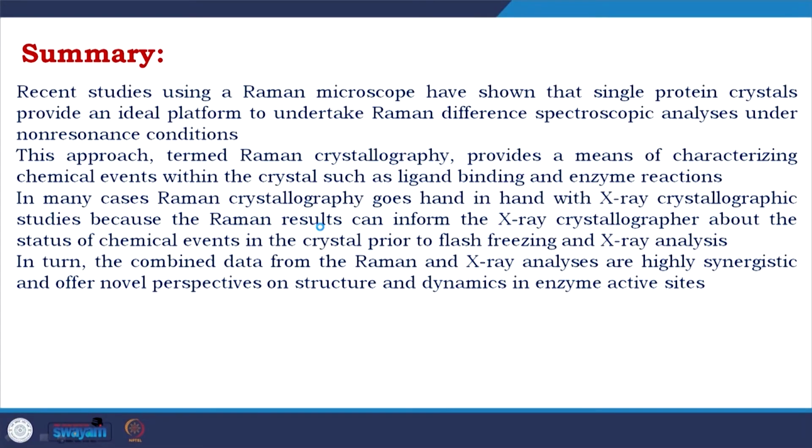But now, if you do a Raman crystallography analysis before going for the final data collection, you could actually know whether your drug is there or not, because you see the characteristic spectra of your small molecule in the Raman monochromator. In turn, the combined data from the Raman and X-ray analysis are highly synergistic and offer novel perspectives on structure and dynamics in the enzyme active site.